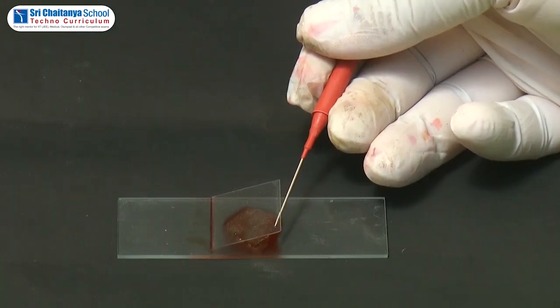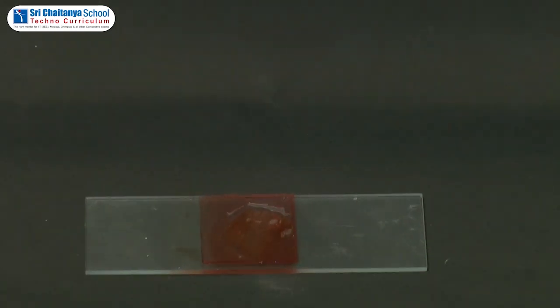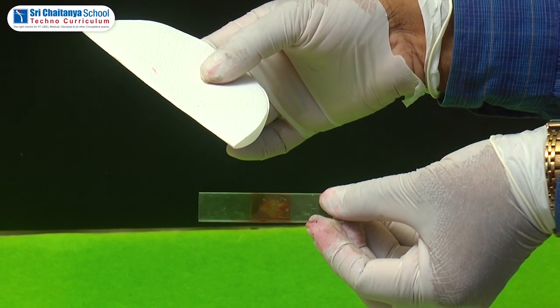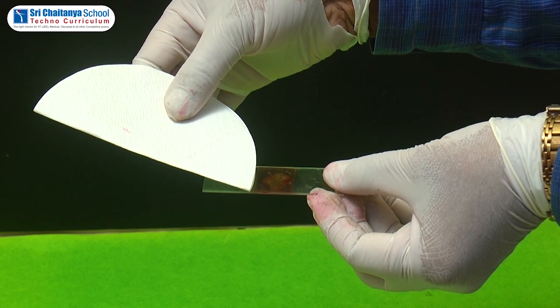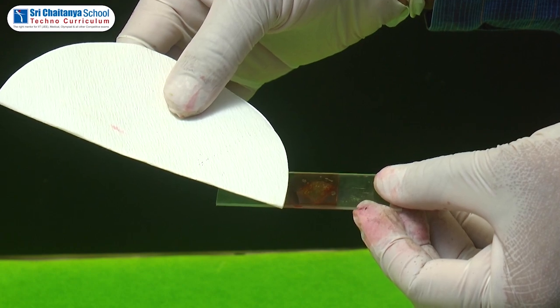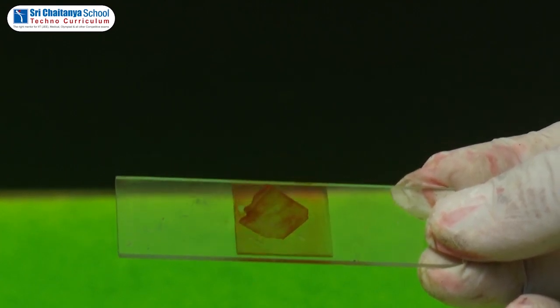Cover the onion peel with the cover slip. Place blotting paper on the edges of the cover slip to remove any extra stain. By doing this, the extra stain will be removed and the section is ready.